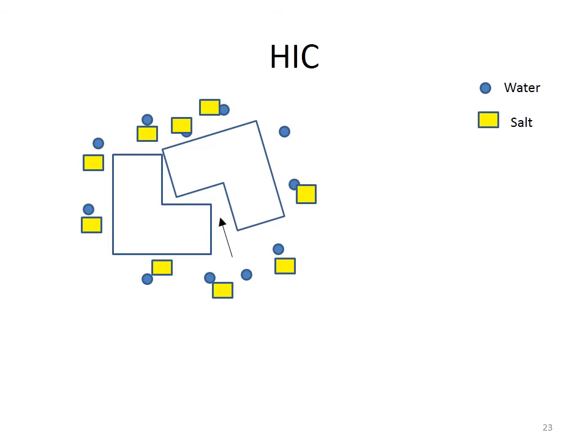And then when we have to elute the protein from the column, we decrease the salt concentration, and when the salt concentration decreases, the protein folds back into its original structure, and hence the hydrophobic regions become shielded. When they become shielded, they won't be able to interact with the stationary phase. Hence, that protein will be eluted from the column.